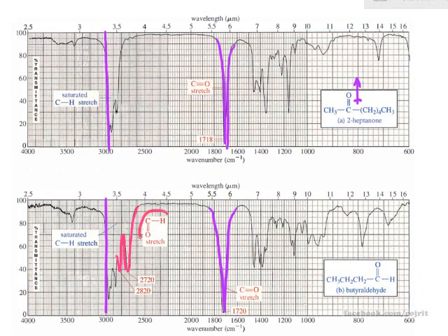This is the characteristic absorption of the aldehydic proton. So if you have the aldehyde functionality, you will see 2700 and 2800 at slightly the same height, the same absorption intensity, right?